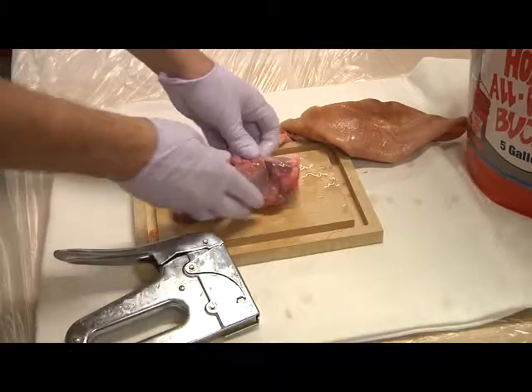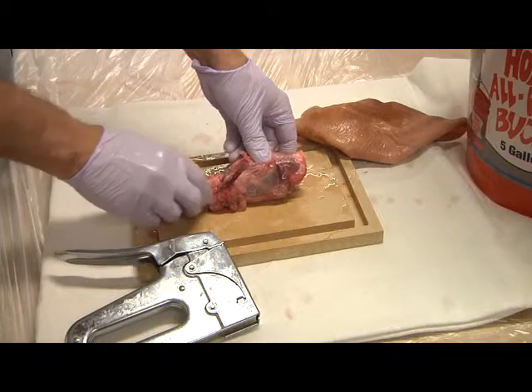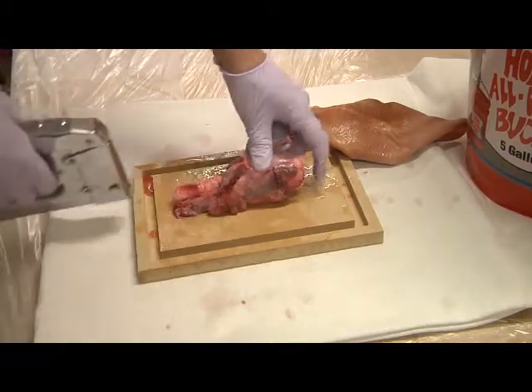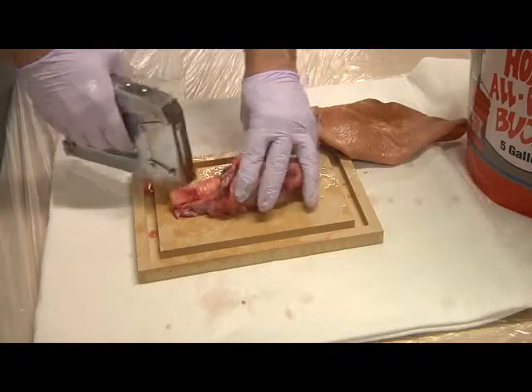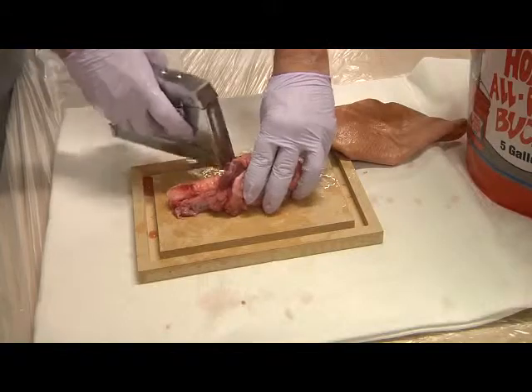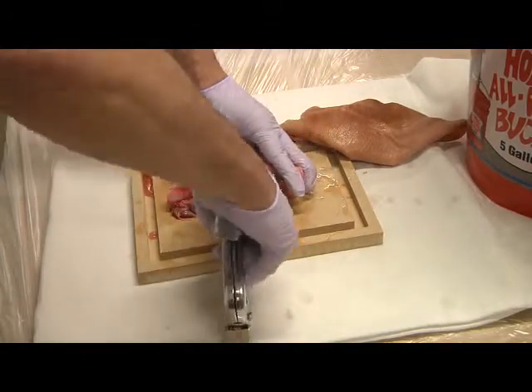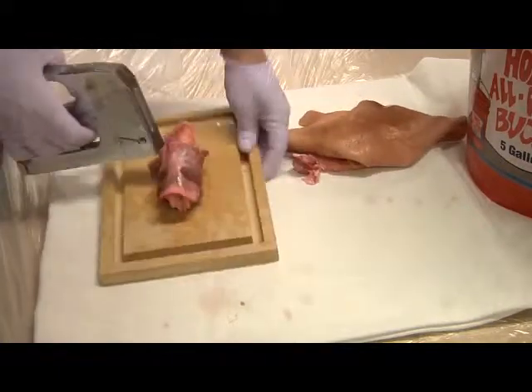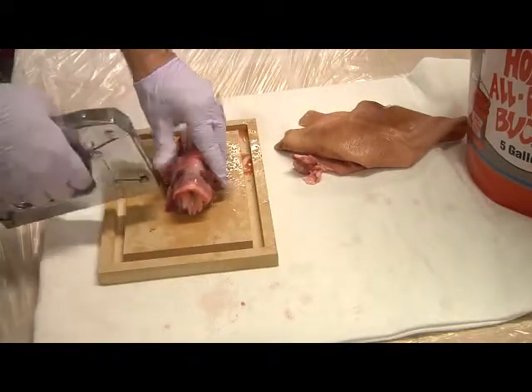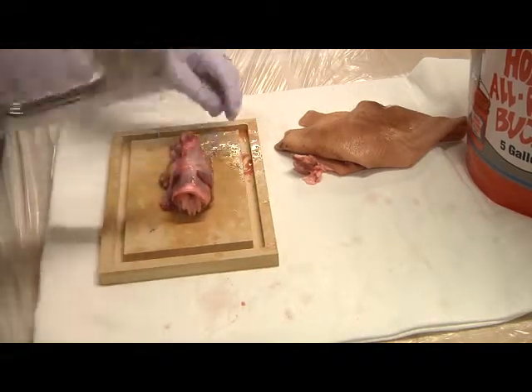So the way to prepare the specimen, I'm going to place the larynx and trachea in the middle of the board, and then I'm going to take my staple gun and just staple into some of the excess tissue. That's very messy. Usually 4 or 5 staples will suffice.